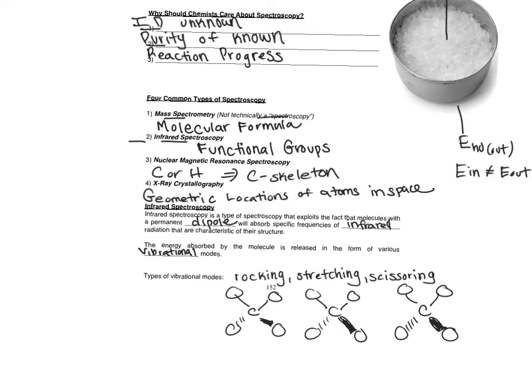That I'm not defining. So maybe I'll color it just so that's clear. So there's nothing, these aren't O's, for example. These are just generic whatever groups are attached. But what happens is the resonant frequency, a term you might remember from physics, for the infrared region would allow the molecules to absorb energy so that their bonds would actually release the energy in the form of vibrational mode.